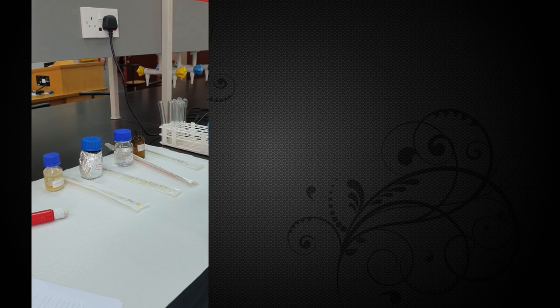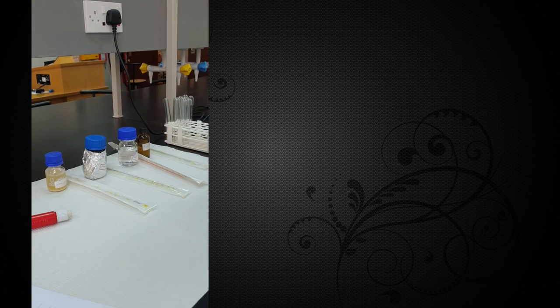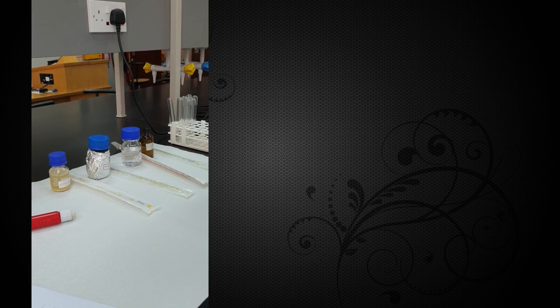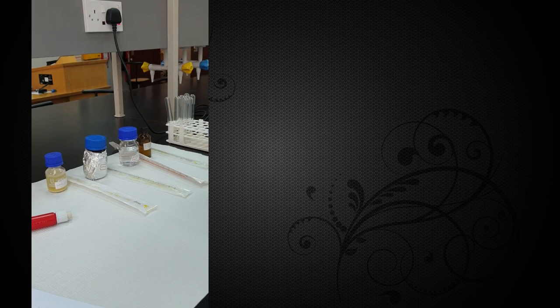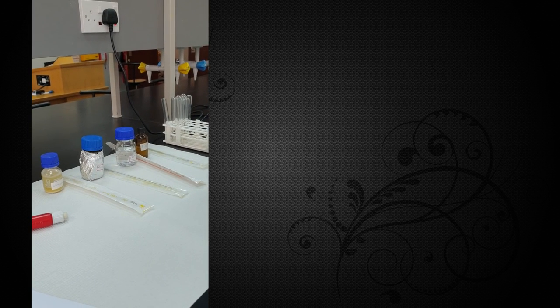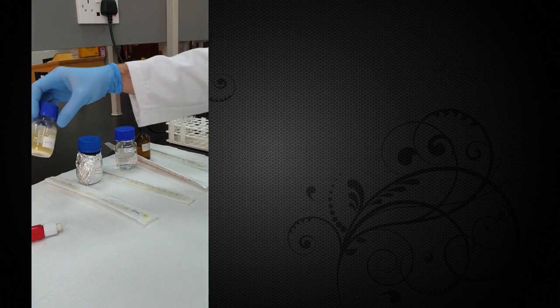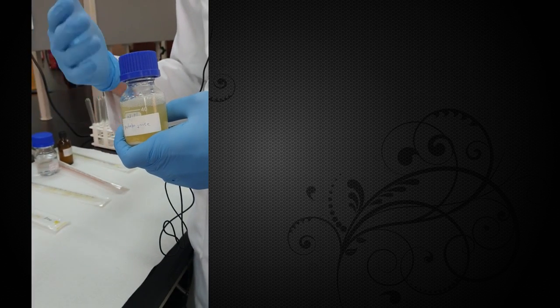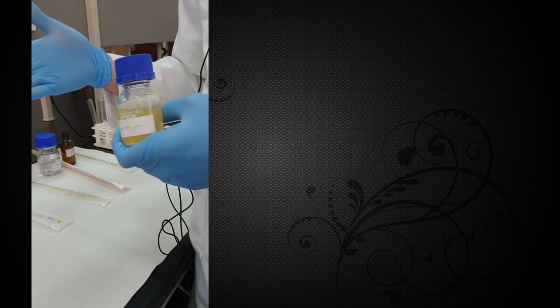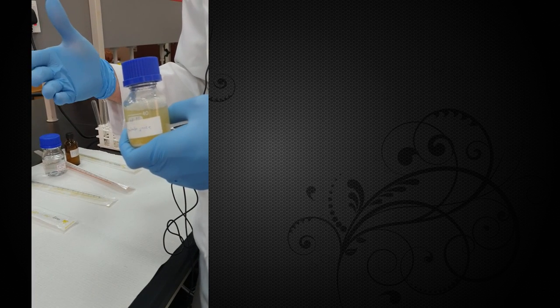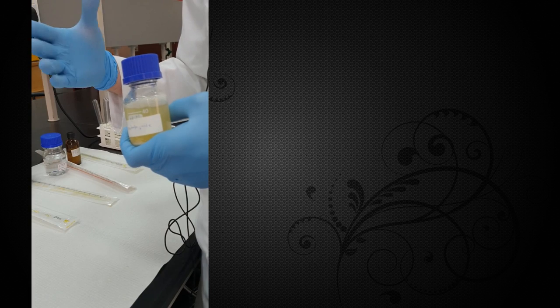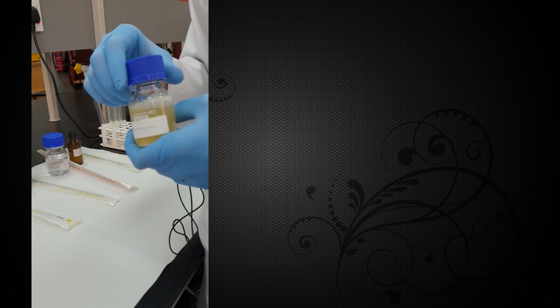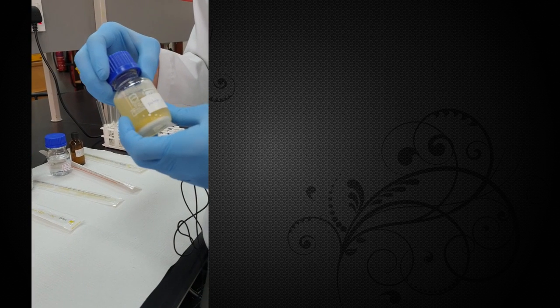In this experiment, we're going to be looking at enzymatic inhibition of an enzyme called catechol oxidase. This enzyme is found in a variety of places, including potatoes. For example, when you cut open a potato or bite into an apple, over time it goes brown. That is the product of the activity of this enzyme. Catechol oxidase causes that browning.